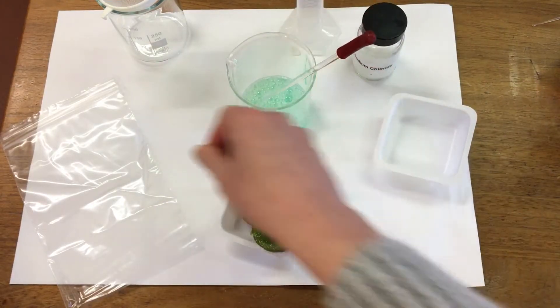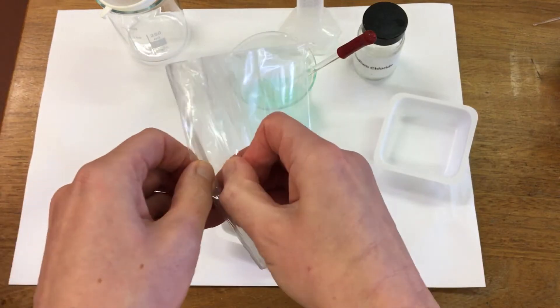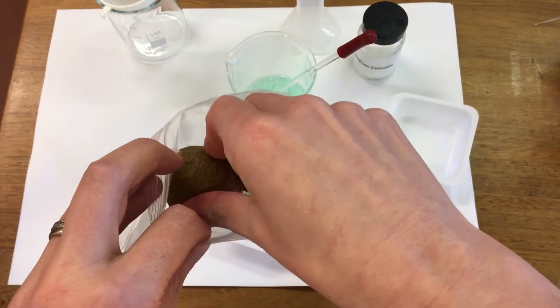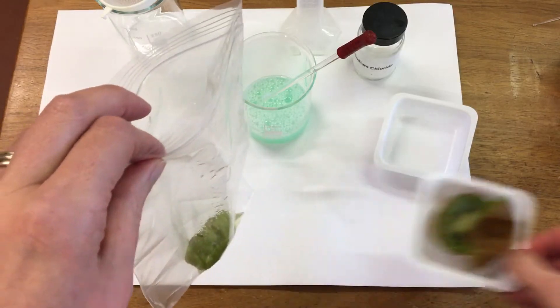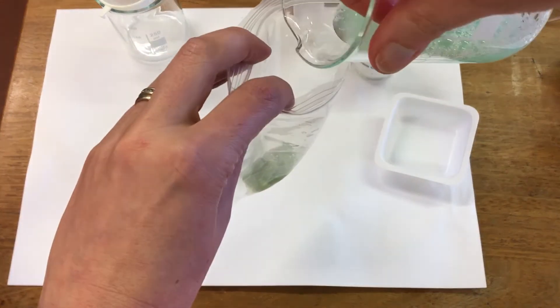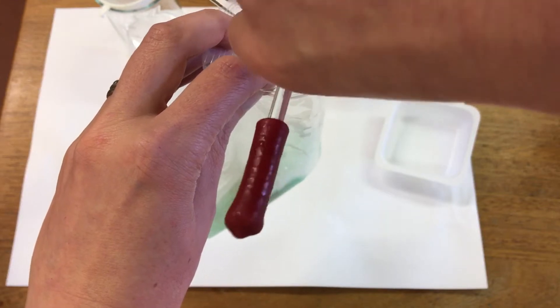I'm then going to take a plastic bag and we're going to put half a kiwifruit into the plastic bag, and then we're going to add our extraction solution — so that was the water, the salt and the washing up liquid.